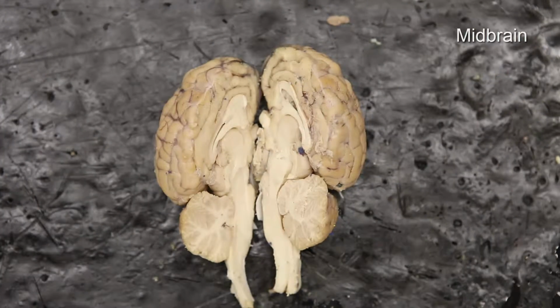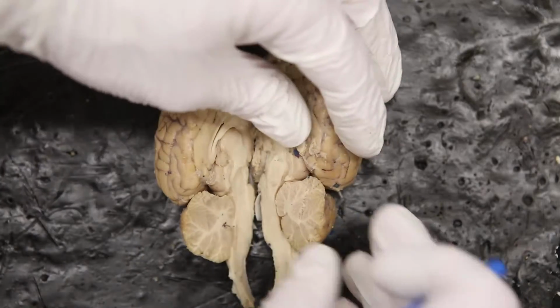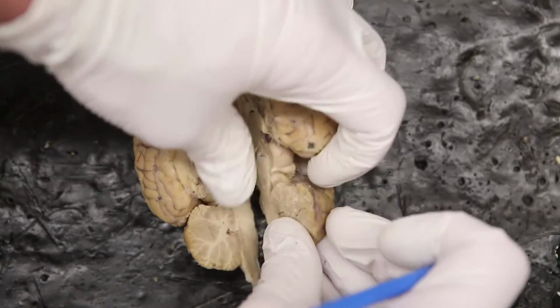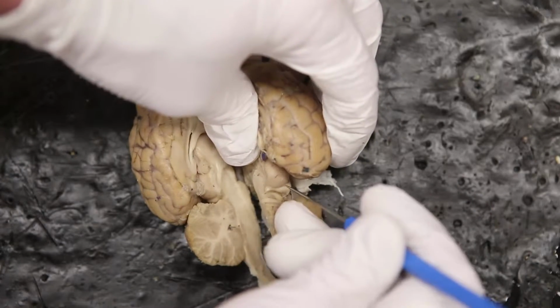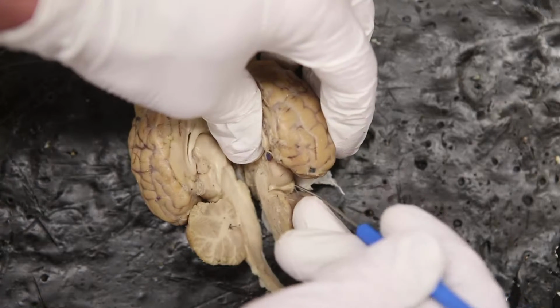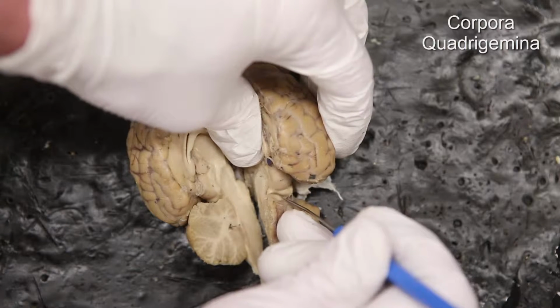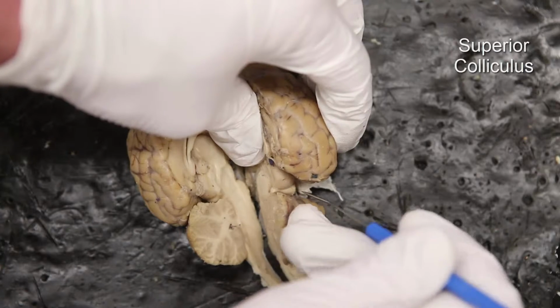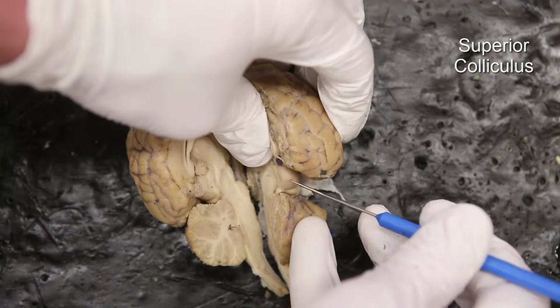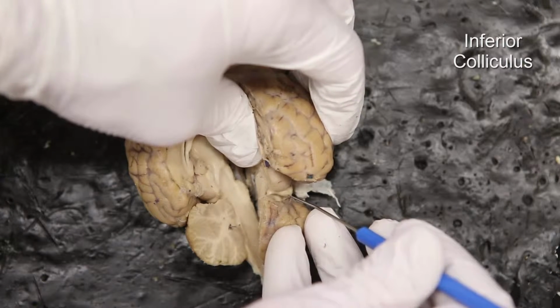If we look just above, or just superior to the brainstem, we can see right up here there's this bump. If we move this a little bit like this, you'll be able to orient that there are actually two bumps in here. We have one here and one there. Together, plus the other side, these are referred to as the Corpora Quadrigemina. The top one here is the superior colliculi. This one on the bottom is the inferior colliculi.